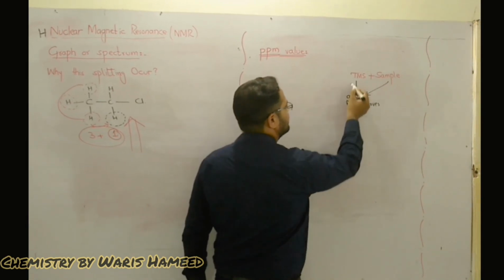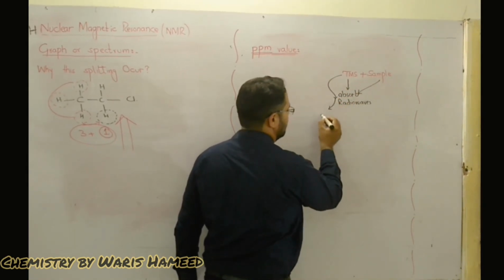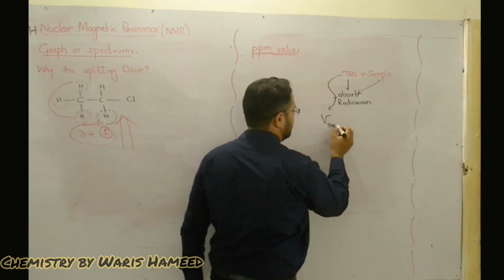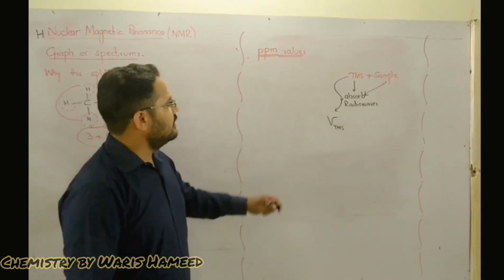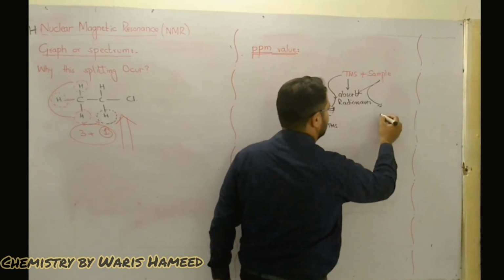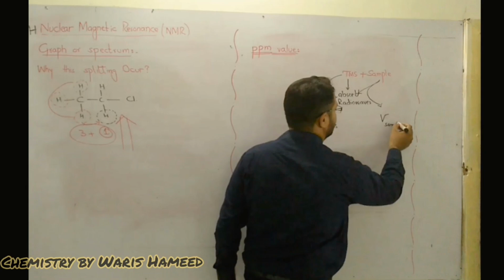The absorbance of TMS is shown by this sign, and the absorbance of the sample, or organic molecule, is shown as this.